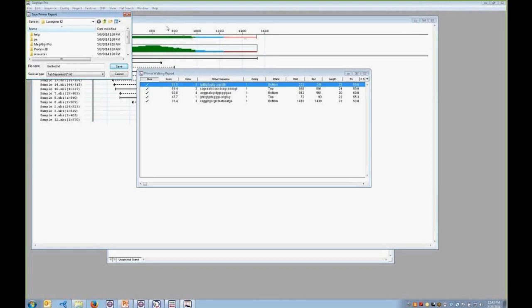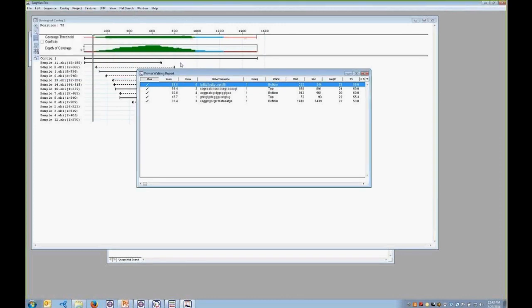So at this point, I'd like to open it up to any other questions or comments that anyone has at this time. Sure. We do have one question, Aaron, so far. Again, feel free to chat in your questions to me at any time here. Someone wants to know, if they're a beginner to primer design, just getting started with a new project, which of these three applications that you showed today do you recommend for them to get started with?